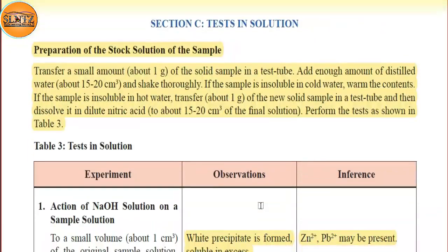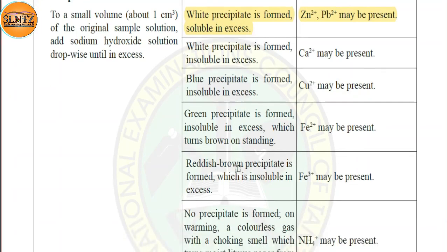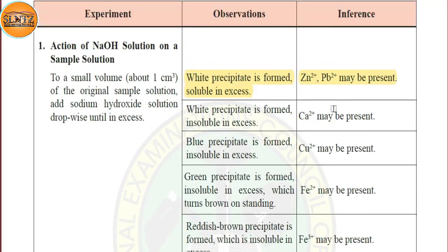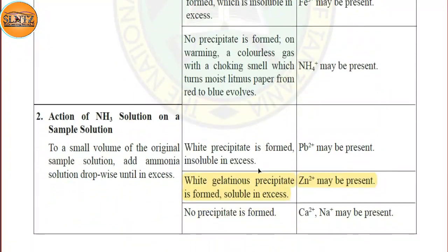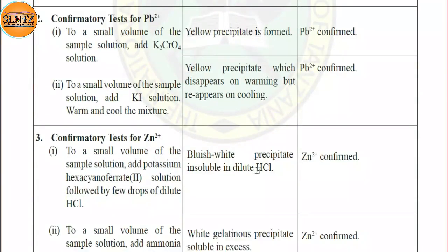We are going to see the inference that appeared most frequently, the first. And then after looking at which ions appeared in the inference most times, we have to see the reagent present in a table. So we start with the compound which appeared most frequently. We see there is zinc, the first, zinc. So we are going to see in the confirmatory testing how zinc is confirmed.